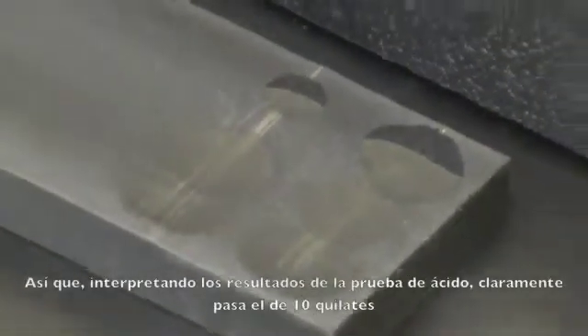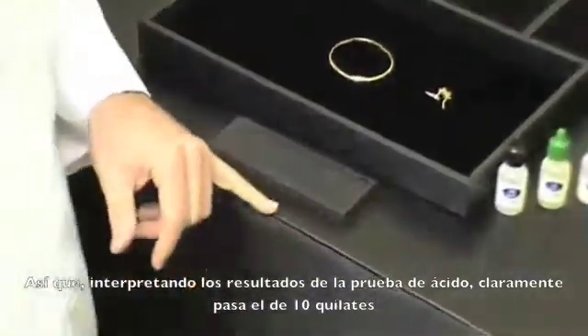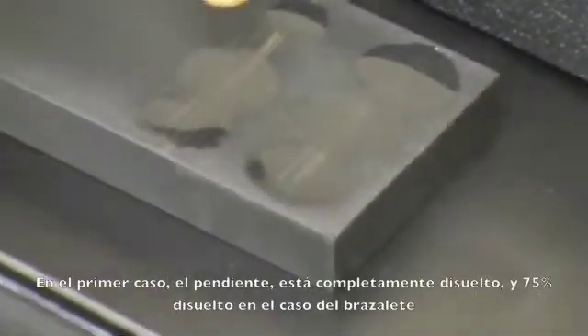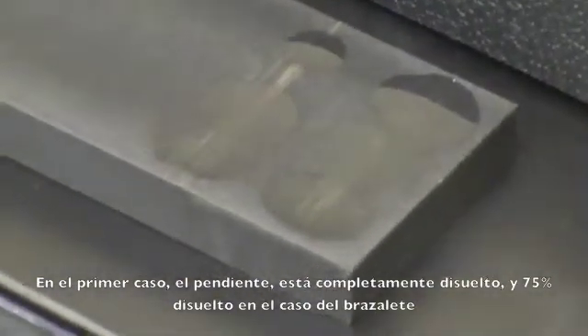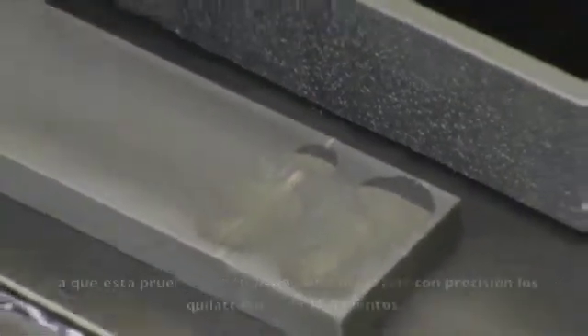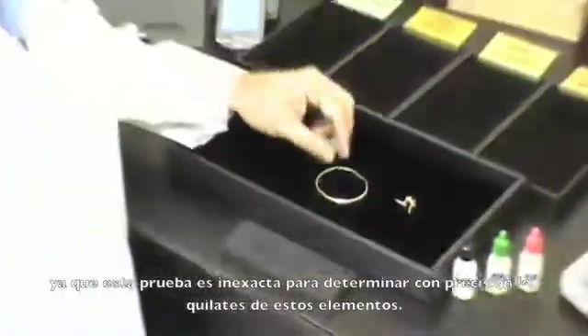So interpreting these results of the acid test, it clearly passes the 10 carat. The 14 carat in both cases is starting to dissolve, and in the first case of the earring it is completely dissolved and about 75% dissolved of the bangle. So both a pawn shop and a jeweler would consider this 10 carat, as this test is very inaccurate to tell you the precise carat of these items.